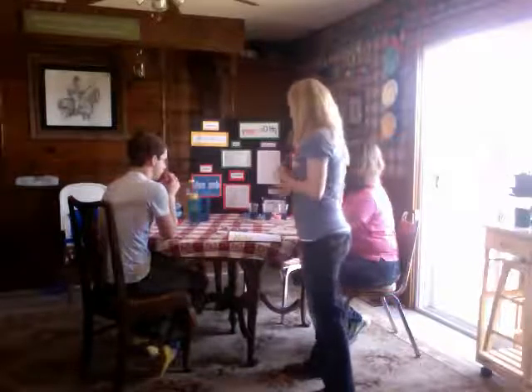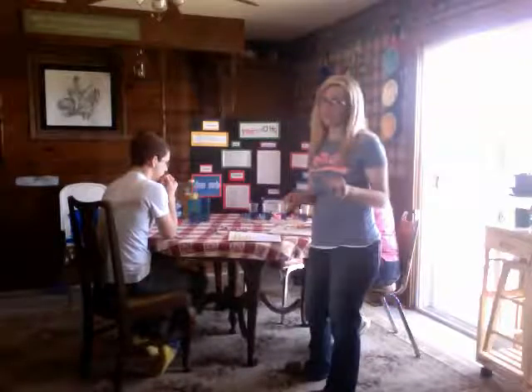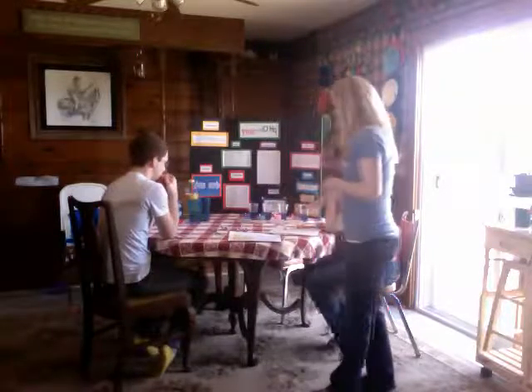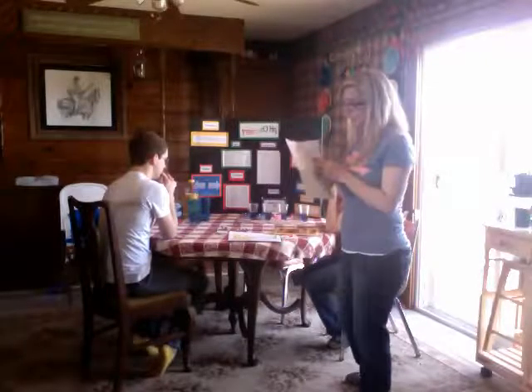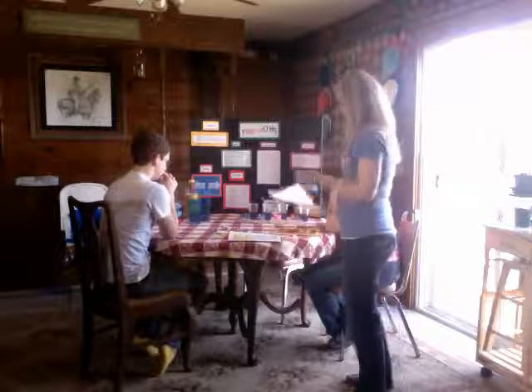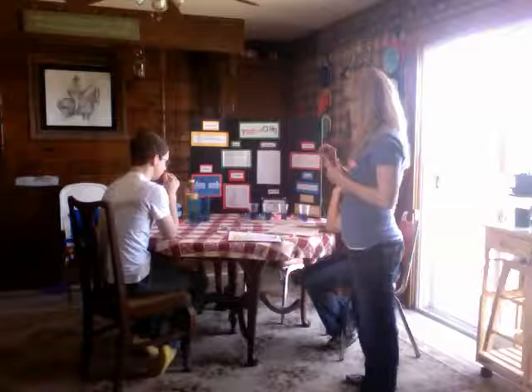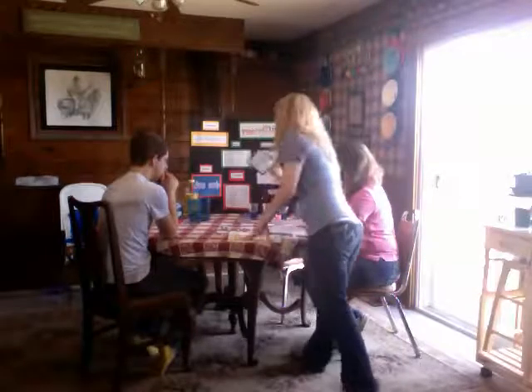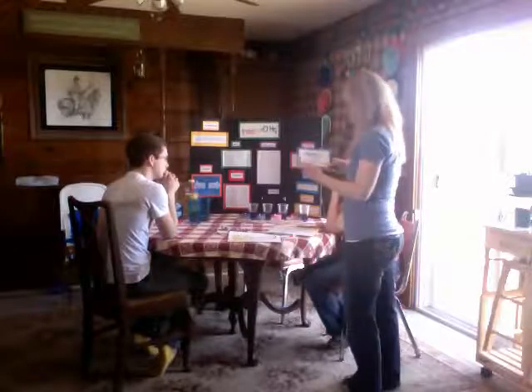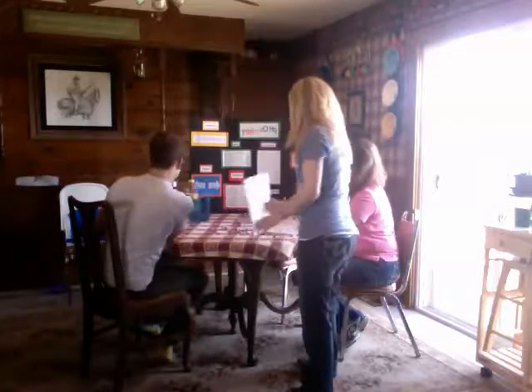And then they're going to take their pH strip, their test strip, dip it in, and wait approximately 15 seconds. Then on their data collection sheet right here, next to whichever variable they just tested, they're going to be writing down what color the pH strip changed to, and on the pH scale that I have right here, they are going to be recording what the number was. So if you guys would like to go ahead and start, I'll leave that right there so you can use it.